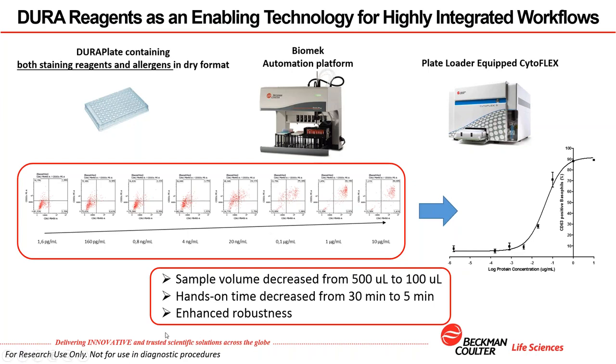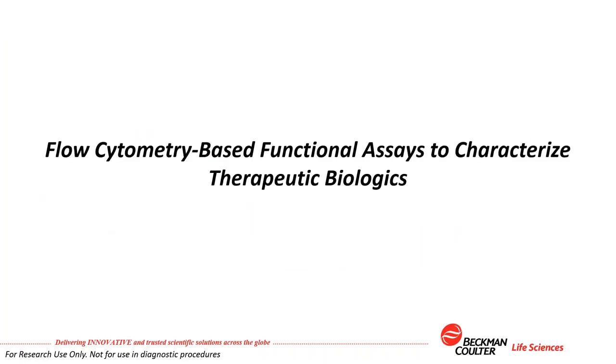And of course, the expectation as well is that the robustness can be of a very good level, taking advantage of the automation on top of the reagent format. So this is ending my part on basophil activation testing.